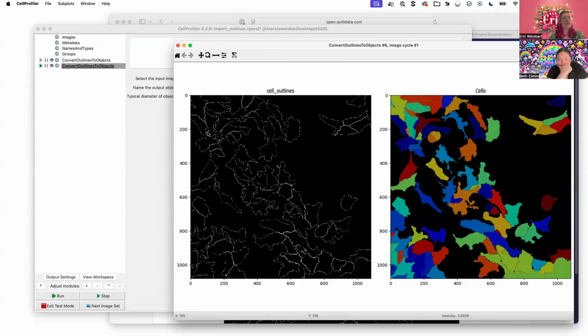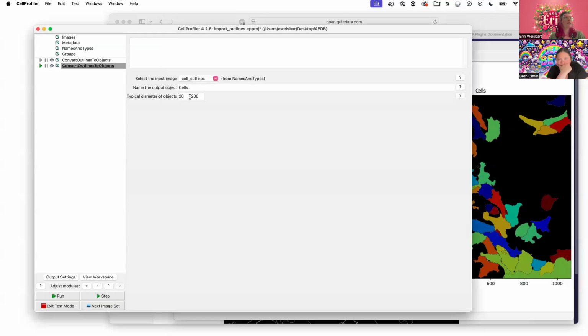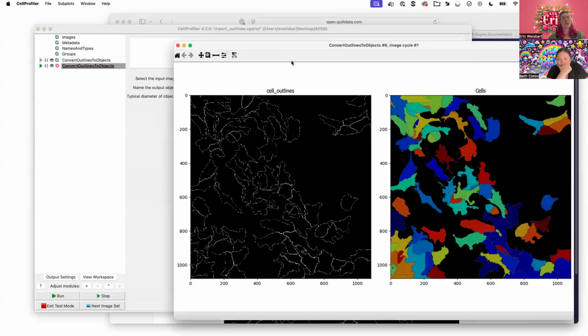If I go back to 0, there are probably some regions here that... no, actually, that did pretty good.